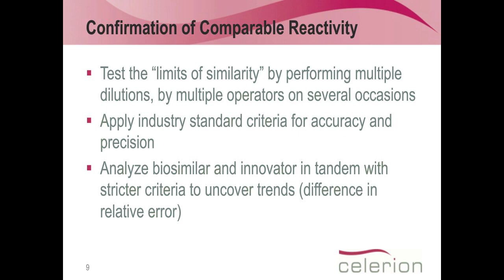So basically what we are doing here is we are making different independent dilutions from stock solutions to the levels of QC levels now. This is also usually not necessary when we're talking about the normal ELISA assay validation, where this is usually a single dilution from the stock solution. But we do it now multiple times and we average out the effects. So we are basically adding a lot of variability from just the preparation in there.